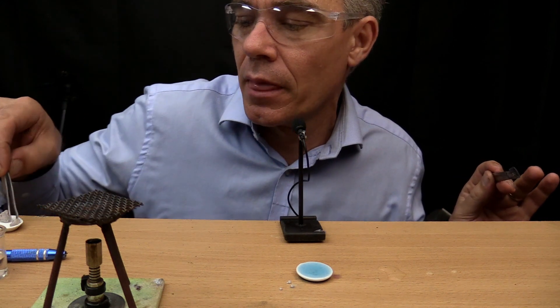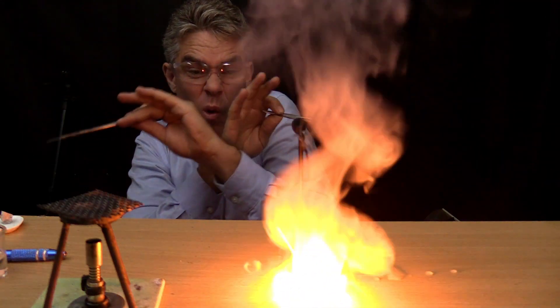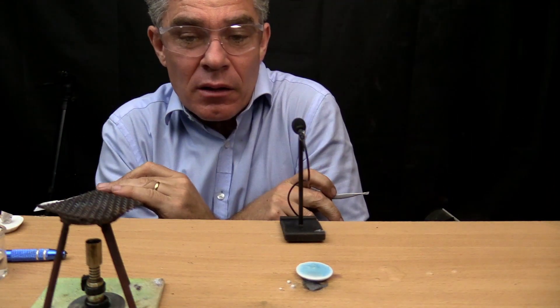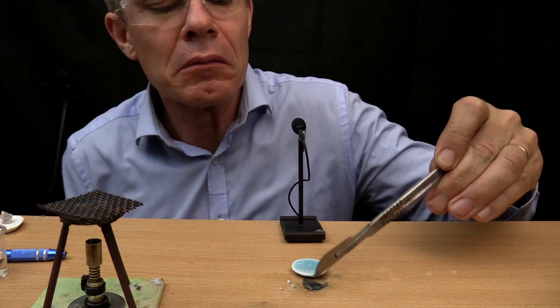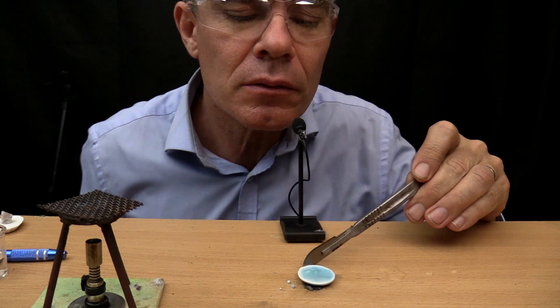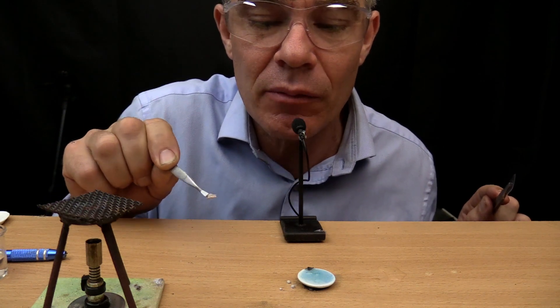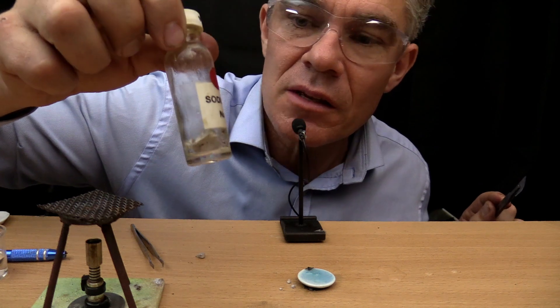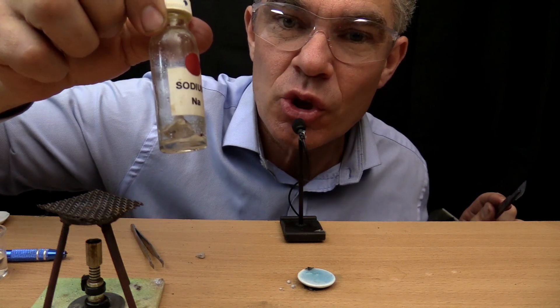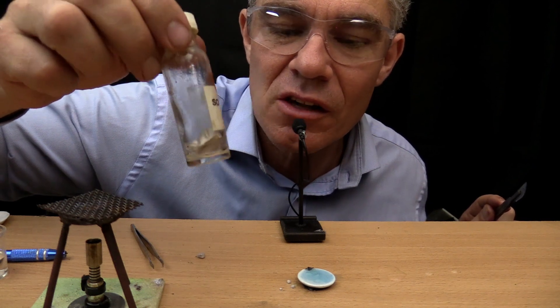Let's try that again. Oh wow, wow, wow. That was very exciting. It burnt my table. Notice that it swam around on top of the water. The Latin name for swimmer is natrium. See the symbol for sodium — N-A. That's short for natrium, which is the Latin for swimmer, because it swims around on the top of the surface of the water.